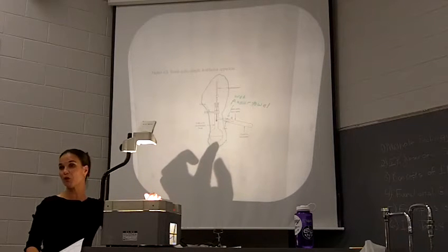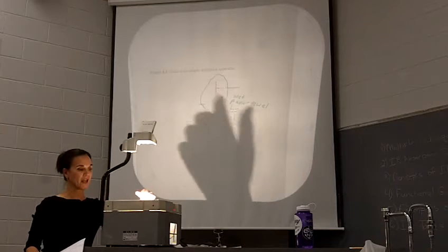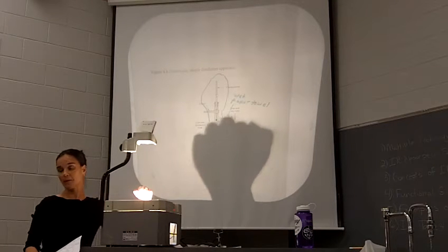You don't want to go to dryness, so make sure you stop it before it is completely empty in your distilling flask. You want to leave just a little bit of volume left in there, okay? But this is how you would collect the boiling point of your unknown, as well as purify your unknown if it's a liquid. Okay?